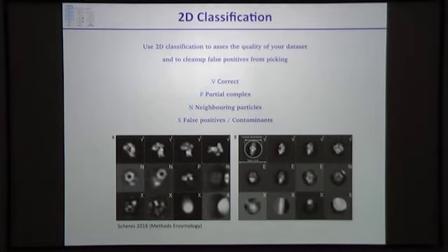So you will find that when you start running your 2D classification runs, you will see very good classes, or at the beginning they might not be so good, but they look like a reasonable particle. And this is a good opportunity to get rid of badly picked particles, Einstein from noise. In this case, the data set was picked with a reference, and although most of the particles were picked where there were particles, some background noise was picked with those references, and they come up as this Einstein from noise. So you should get rid of those very noisy particle-like things, and this way we get very clean data so that we can move on.